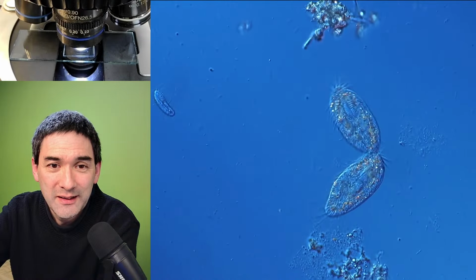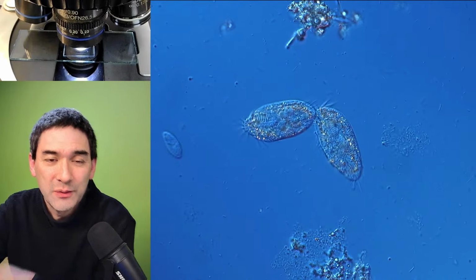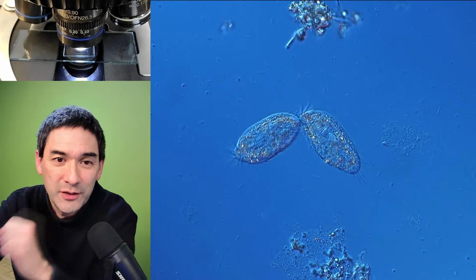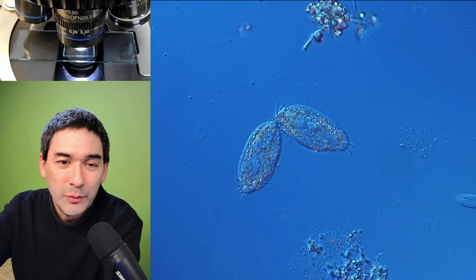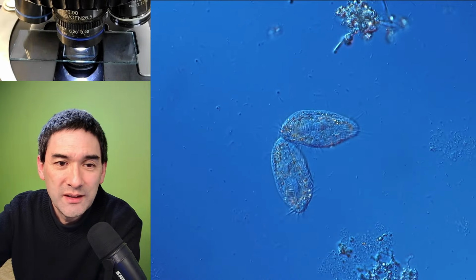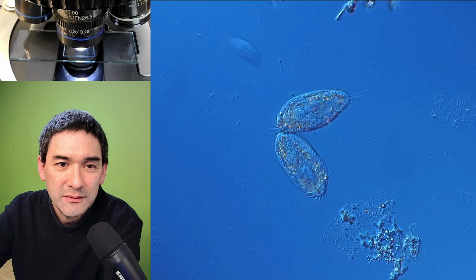So actually, I do want to follow this along now. But you see, there it's almost divided. They were much more connected before, so it starts to become thinner and thinner and thinner, and then they separate. And one of the nice things here is that you can see the cilia moving.